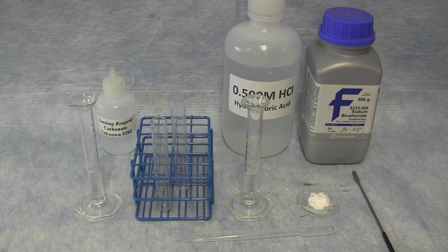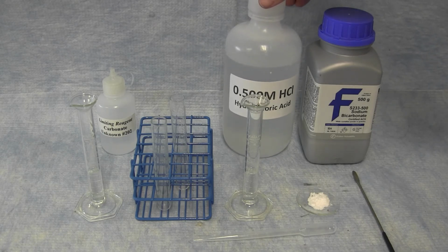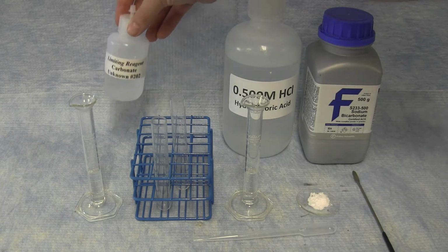The next set of reactions in the experiment still is looking at the limiting reactant based on observations. However, in these observations, it is not a precipitate that forms, but something else. The first reaction looks at 0.5 molar hydrochloric acid and your carbonate unknown.